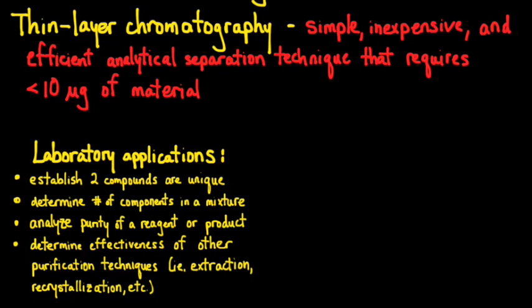It is also used to determine the effectiveness of other purification techniques, for example, extraction and recrystallization, or even a distillation if the liquid is non-volatile. Finally, it can be used to monitor reaction progress and identify when a reaction has run to completion.